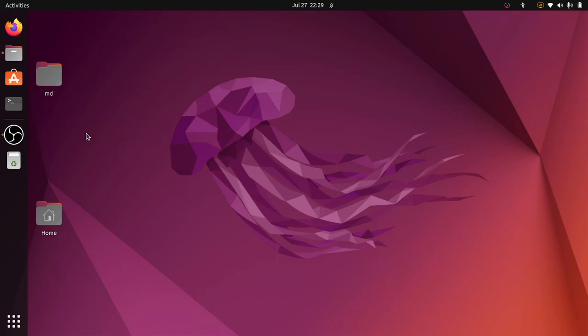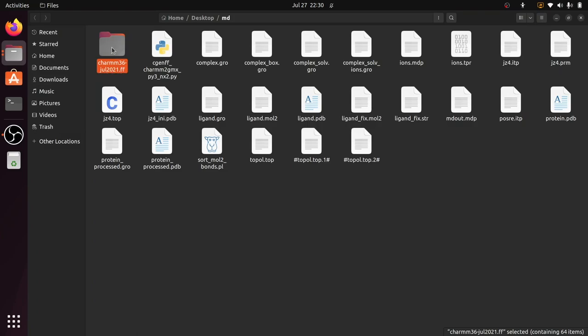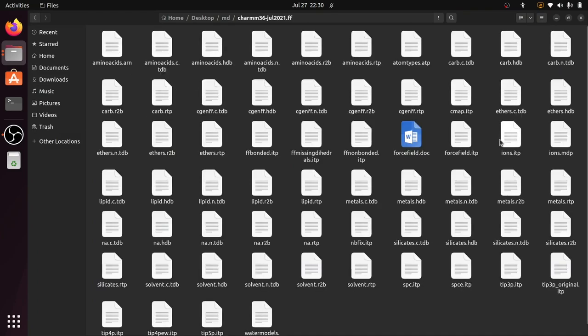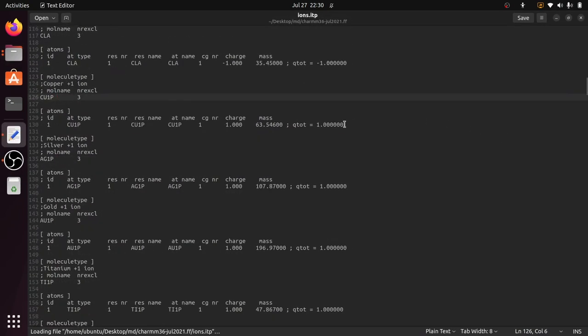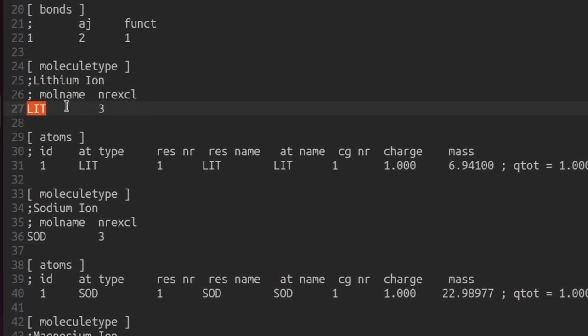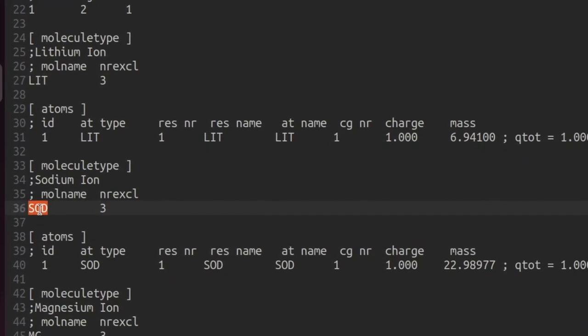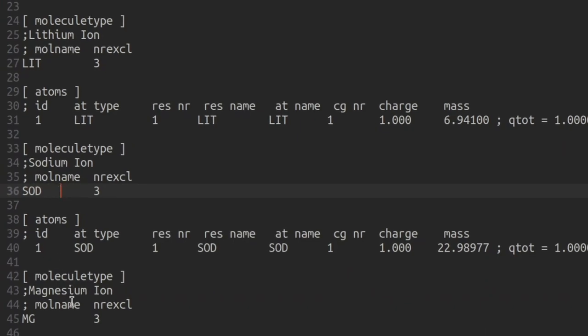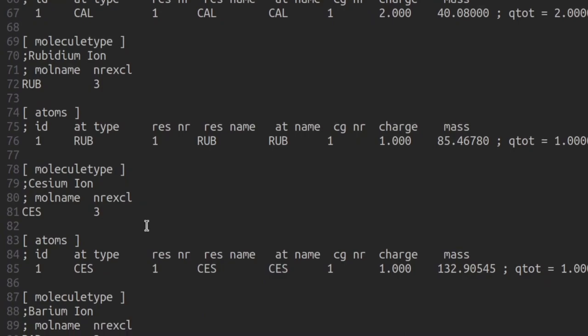Welcome everyone. This is the next part in the GROMACS tutorial series. Before going into the next step, I want to show you one of the changes in the July 2021 version of the CHARMM36 force field, specifically in the ions.itp file. In the ions.itp file, some of the ion names are renamed. For lithium ion the code is LIT, sodium ion is SOD, and magnesium ion is MG. The ion names are given here.